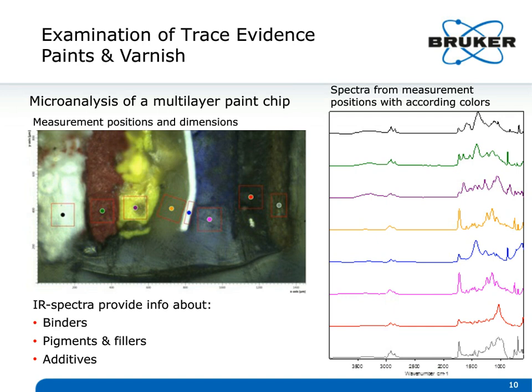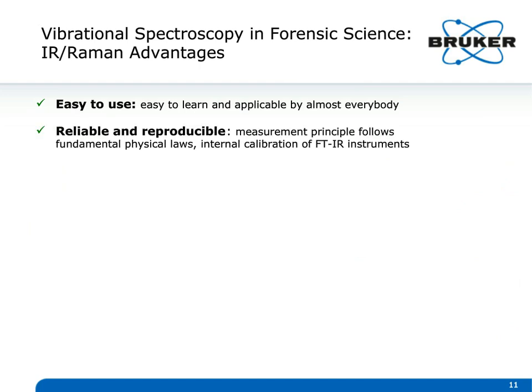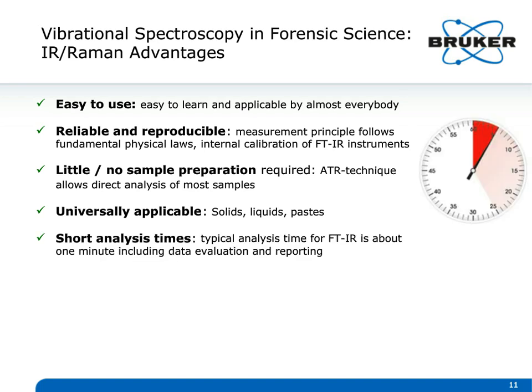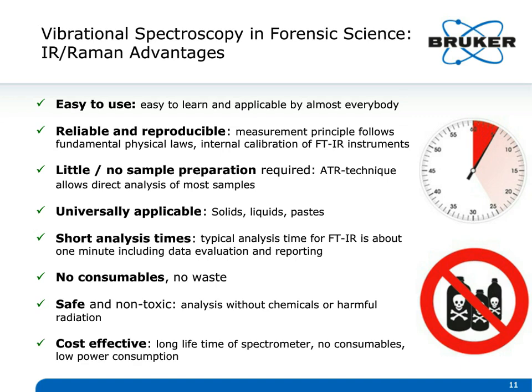So to summarize the advantages of vibrational spectroscopy in this very short 10-minute presentation: first, it's easy to learn, very easy to use. Maybe historically it was a problem where you might figure you had to be an expert to be able to do an infrared or Raman analysis. That's just not true anymore. The competitive marketplace has dictated that things have become much easier and much more powerful in how they can be used by a very inexperienced user.